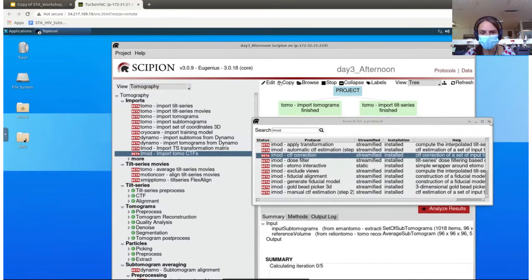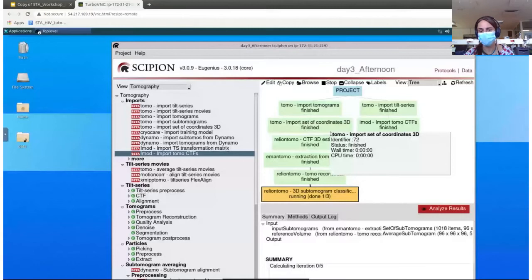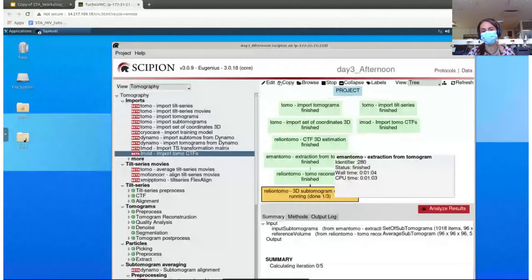Yes, Carlos is asking if the sigma tilt and sigma psi options are a kind of local refinement. Yes, it's just that the subtomograms already have previous information, so they already have some angles in the alignment. It has a priori information. So what it does is that in the direction where we know that they are pointing, meaning the virus perpendicular to the membrane, we won't allow the subtomograms to move a lot in this direction, because otherwise they won't follow the curvature of the membrane, nor in this direction, which is still, so they will keep on following the curvature of the membrane.